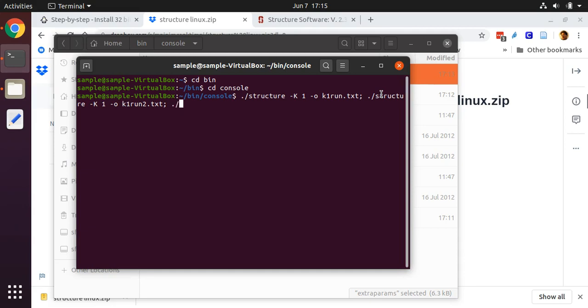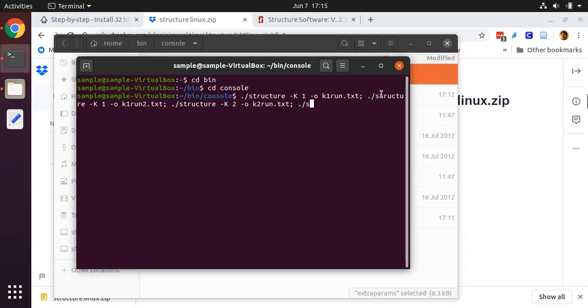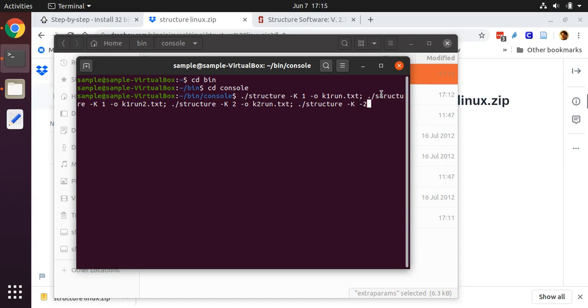Next, I'm going to run STRUCTURE for three groups, I'm sorry for two groups. I'm going to use an uppercase K. Use an uppercase K. I don't know if it matters, but the instructions say to use an uppercase K from the Pritchard lab. And I'll make the last output here k2_run2.txt.